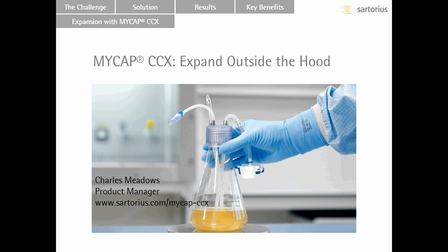Great. Thanks, Charles. So the first question is, what is the void volume in the sampling line?